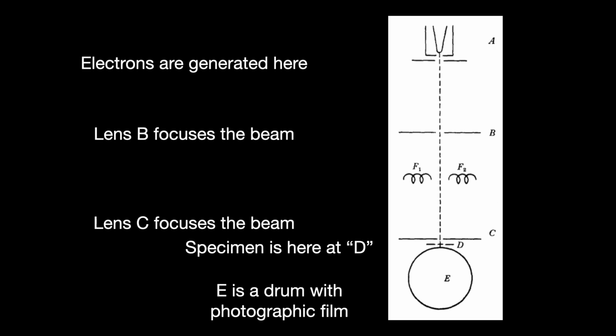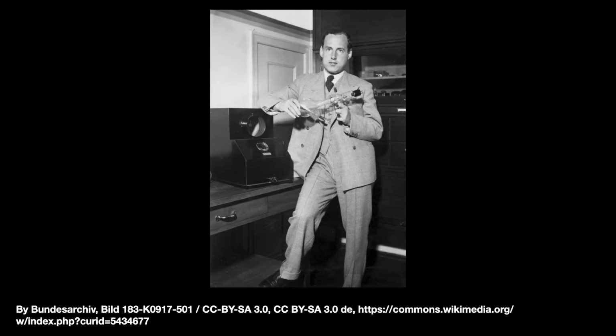His machine was sophisticated but also limited. The beam was not powerful enough, and Ardenne did not have sufficiently sensitive electron sensors, resorting to photographic film. So it took 20 minutes to record an image, and since you can't see if the image needed focusing until after developing the film, you had to sort of wing that part. No images were ever published.